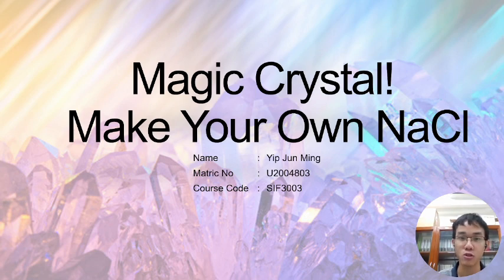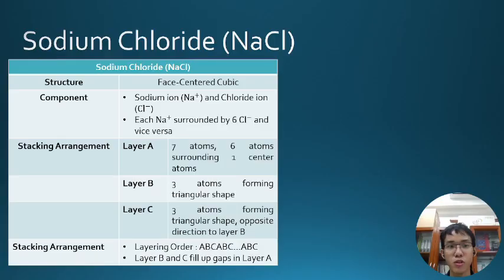It's to make your own sodium chloride crystal. Before we get to the actual work, let's understand the theory behind the work. First, we need to know: what is sodium chloride?